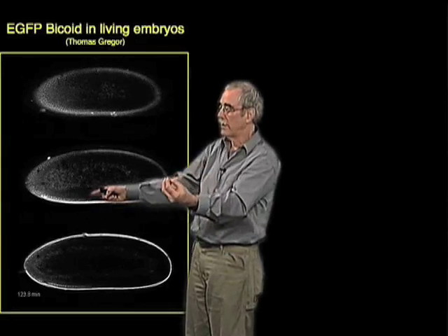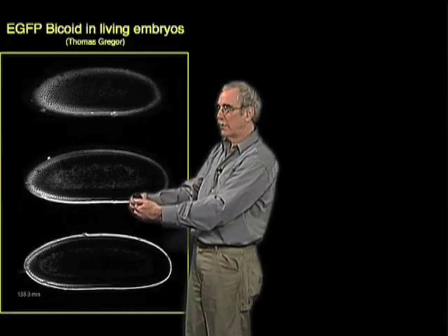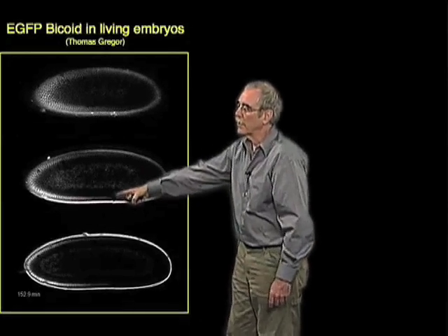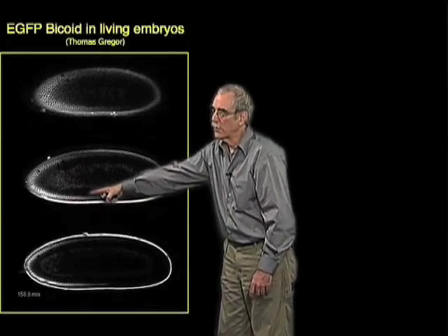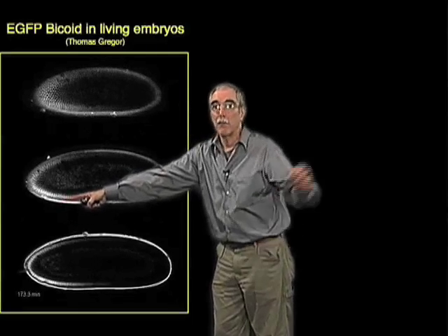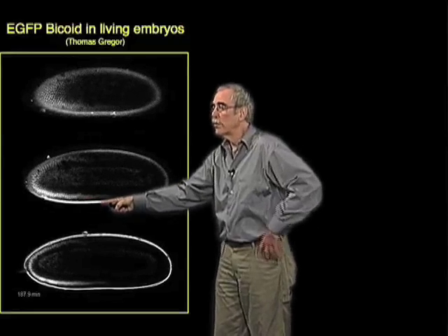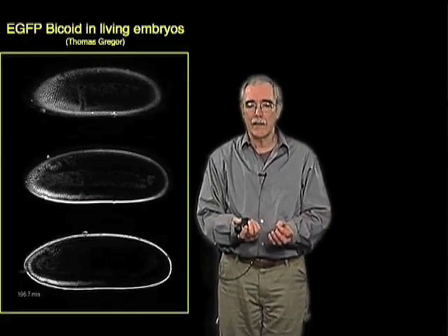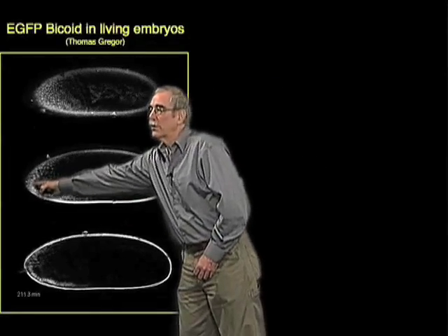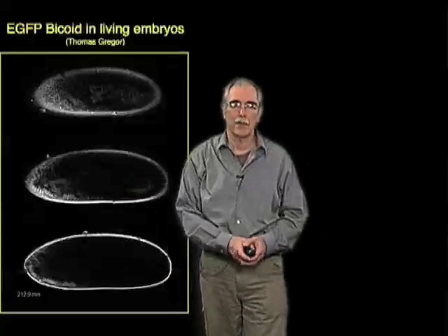You can see that when the nuclei divide, the bicoid protein goes out of the nuclei, and when the nuclei reform after each division, the bicoid protein goes back in. What you can clearly see is that along the anterior-posterior axis there is a graded distribution, such that nuclei at the anterior end have much more bicoid protein, and the levels drop off — so a cell really could figure out where it was in the egg, whether it was the first cell or the hundredth, just based on its position.